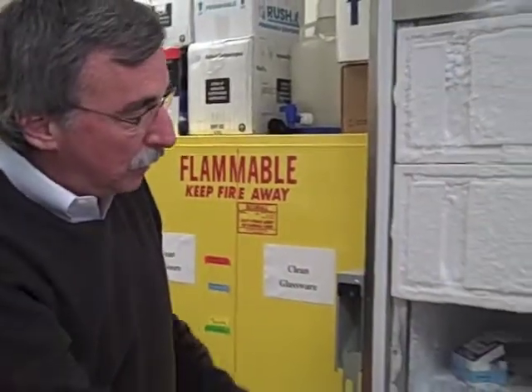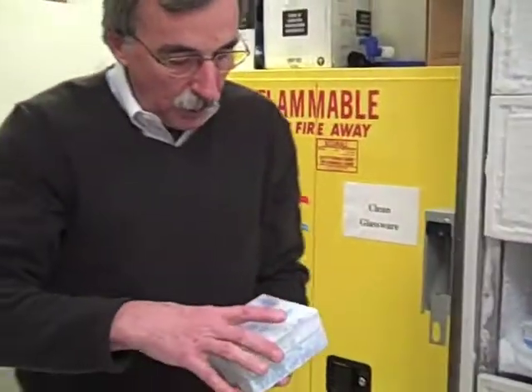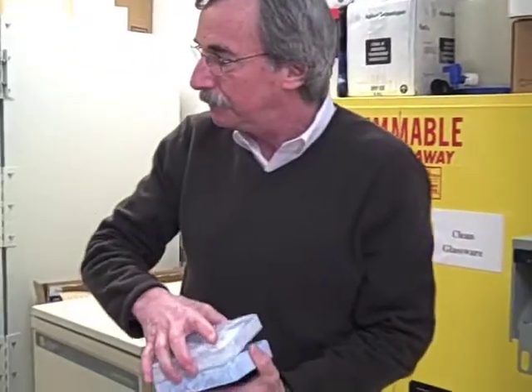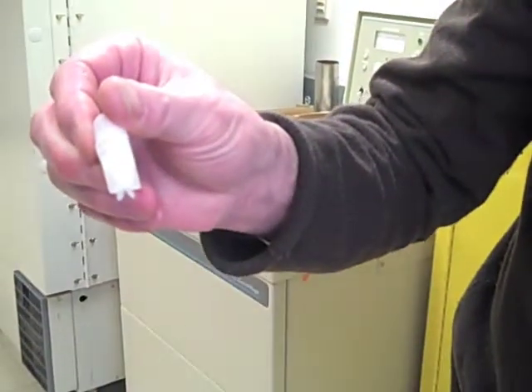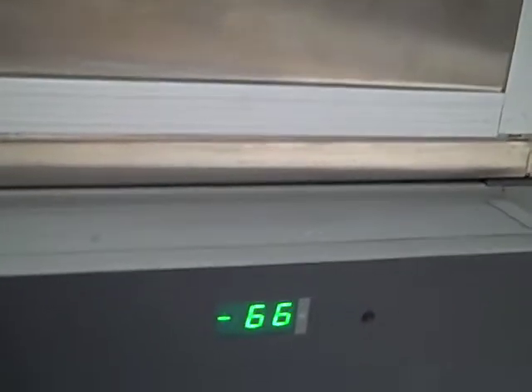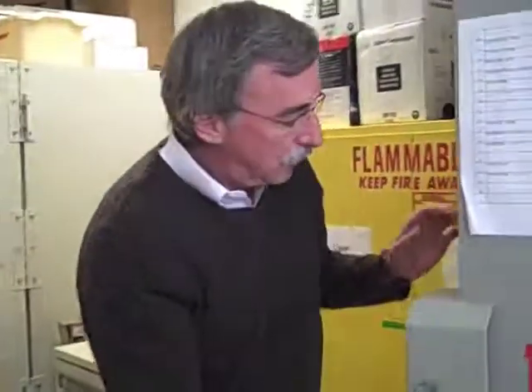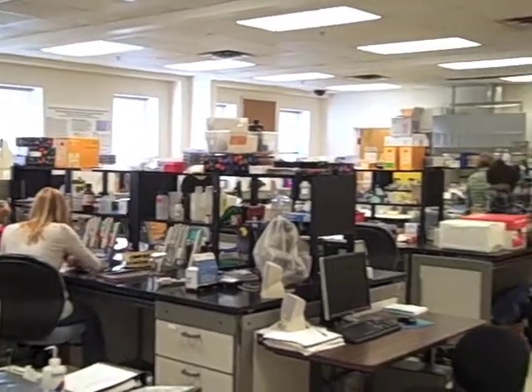The bacteria has been genetically engineered so that it has a human protein in it. We take this freezer stock that we have here of this genetically engineered protein and we start growing it up. The idea is we want to have the bacteria make a human protein. From here we can take the cultured bacteria and we bring it out to our lab.